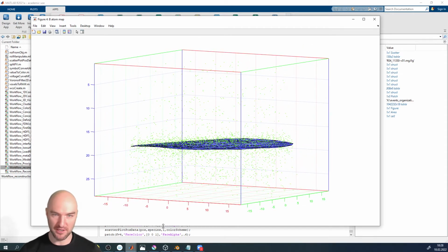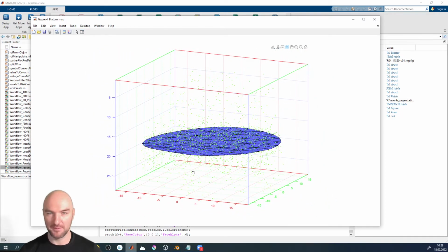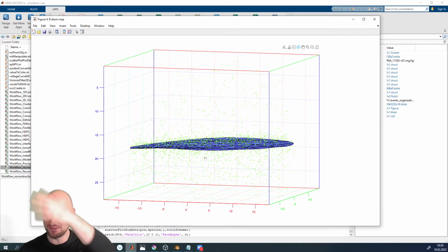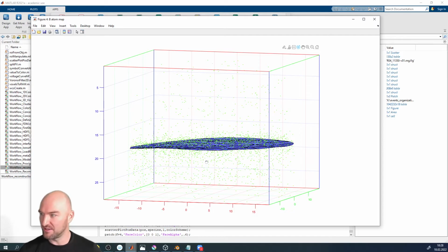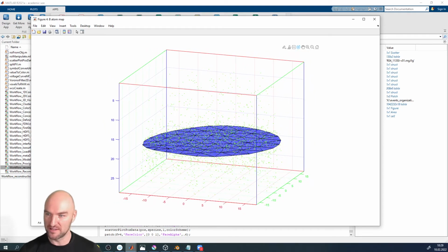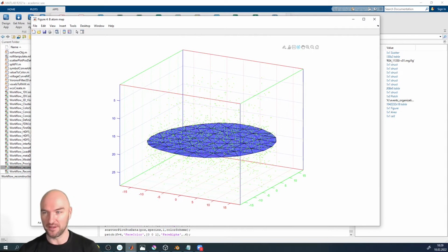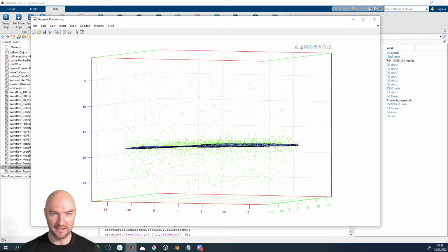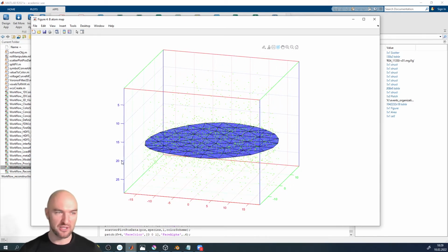But with a little bit of 3D modeling practice, you can create really nice interfaces. I mean, one of our PhD students here, Andy Ferner, for example, had some extremely complex grain boundaries or interfaces, stacking faults that he was outlining using some hand modeling and some other algorithms, and you can get to some really cool models of something, where you can really pull out knowledge about your data that you can't pull out any other way. You can't use an isosurface for that. The grain boundary, you wouldn't be able to do an isosurface for that. And stacking faults.